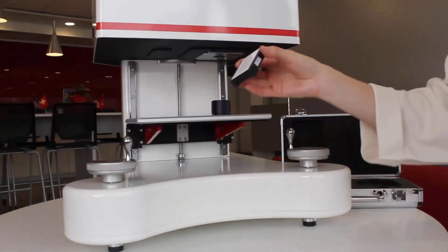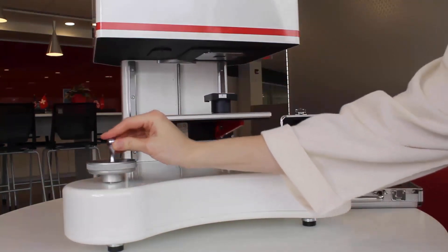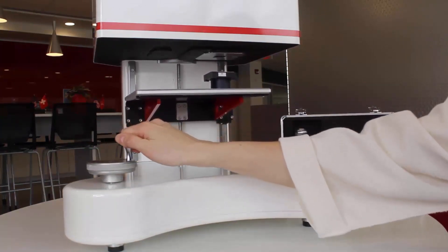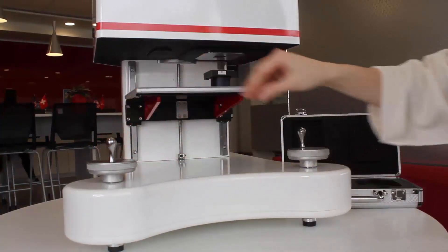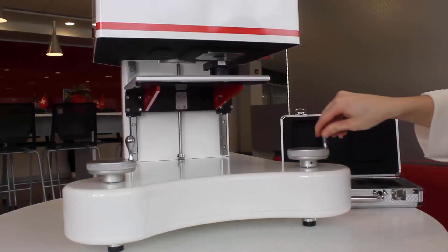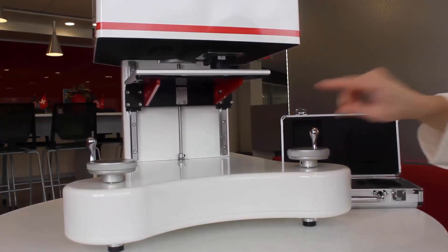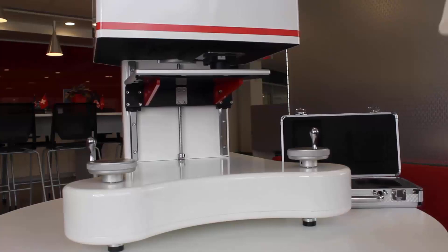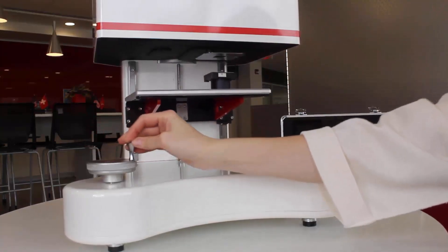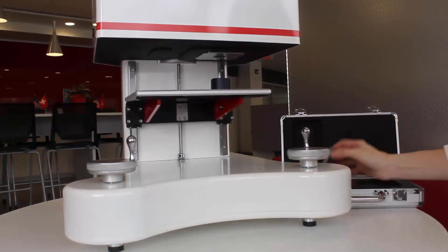If the tray was rotated all the way down, use the coarse dial to adjust three quarters of the way up. The user will adjust the remaining quarter using the fine dial. Rotate the fine dial to raise the white calibration tile until it is in position. After completing the white tile, please repeat the same steps using the green tile.